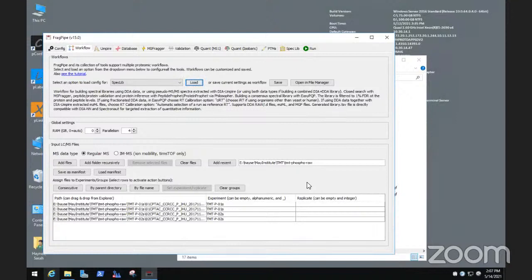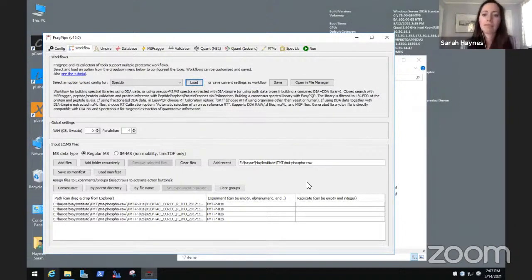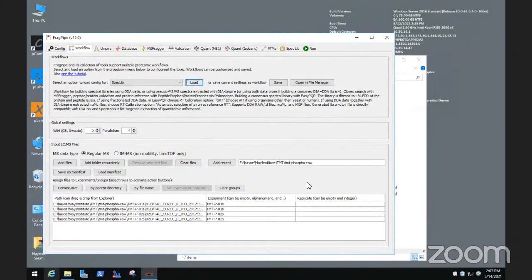The results are really great. You compare it with Spectronaut, and they're pretty much as good as Spectronaut. Spectronaut implemented the DIA-Umpire workflow as part of that tool. We have really great results now with DIA-Umpire in FragPipe, especially if you combine the data with some DDA data for a hybrid library. We're also working on additional workflows, so there is a lot more coming.